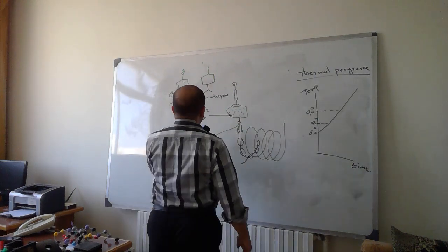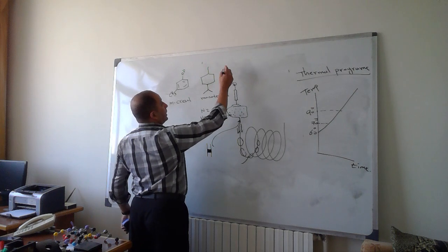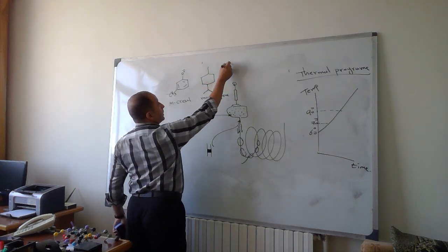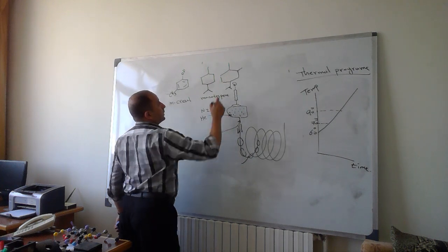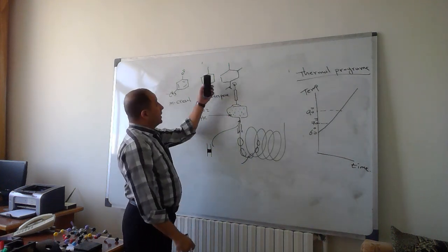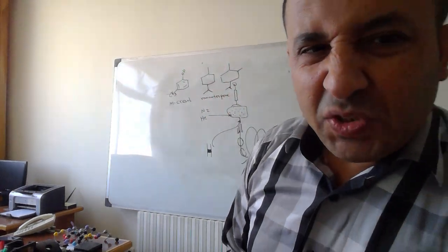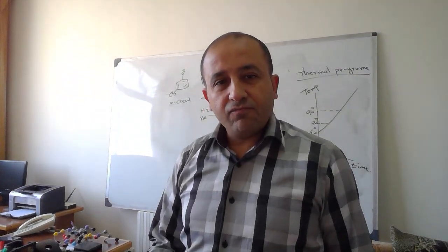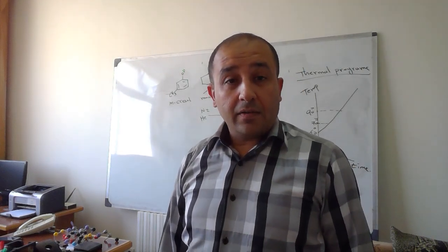Now again, if we have a molecule very close to this molecule, for example, if we have a double bond, or a methyl group like this one, these are very similar, just one methyl group. So there's no substantial variation in terms of volatility.